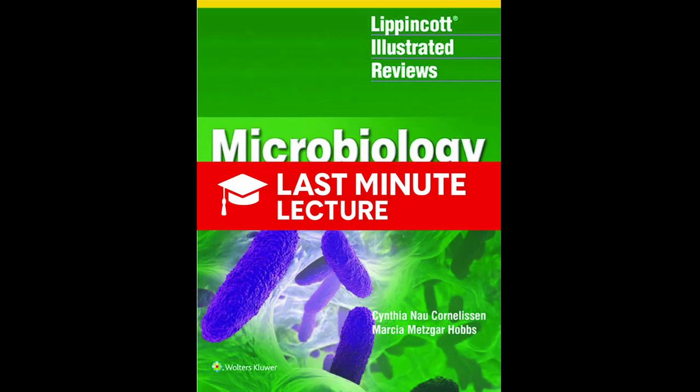And who needs that special treatment? Haemophilus influenzae and Neisseria gonorrhoeae are the classic examples. They won't grow without it. Okay, so that's enriched. What about selective media? Think of selective media like a bouncer at a club. It keeps the riffraff out. A great example is Thayer-Martin agar for finding gonorrhea. Because a genital swab has tons of normal bacteria on it. Exactly. You don't want all that normal flora overgrowing your plate. Thayer-Martin has antibiotics in it that kill all that other stuff but let the Neisseria grow. It isolates the suspect from the crowd.